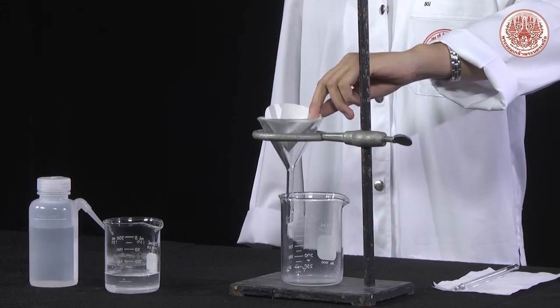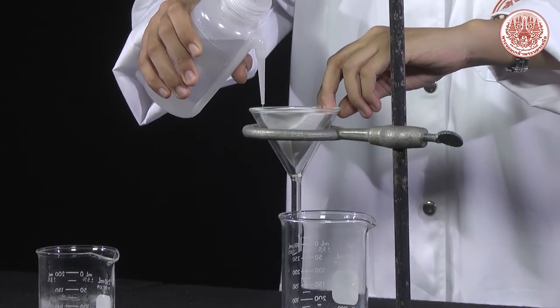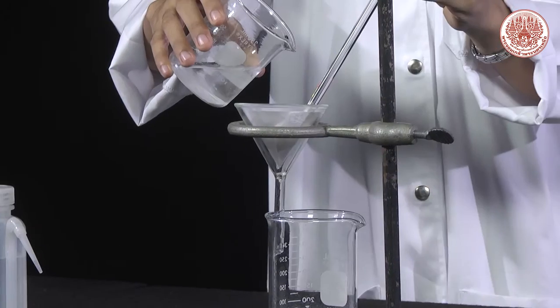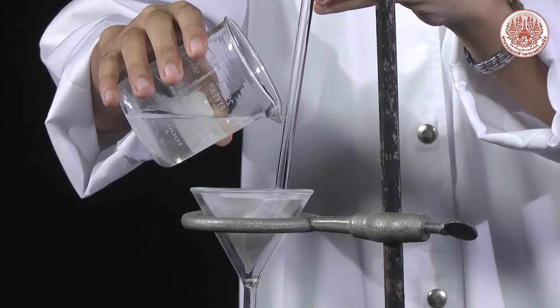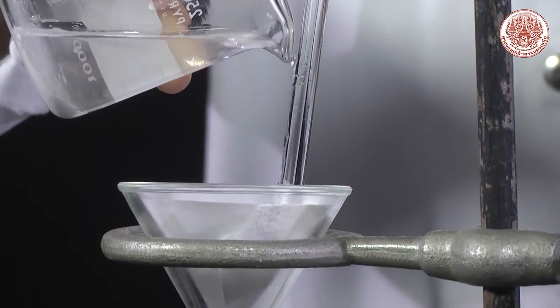Open the cone and press it into the funnel. Wet the filter paper with water so it sticks to the glass funnel. Decant the liquid through the thicker part of the filter paper. Make sure no precipitate passes through.